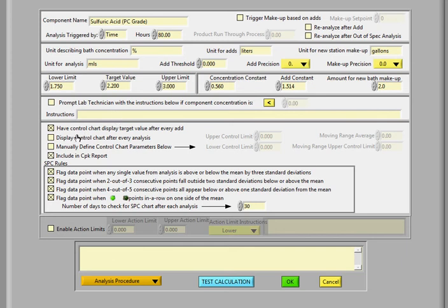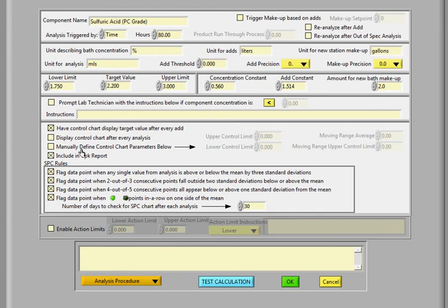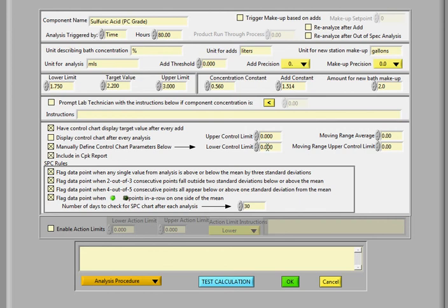This area here is where you can have the control chart displayed after every add. So the technician can see what's going on. And after every analysis, you can also show the control chart with this field right here. You can manually define control chart parameters. Here's the upper control limit, lower control limit. And when you click on this box, it enables these fields. So you can actually set your control chart parameters.